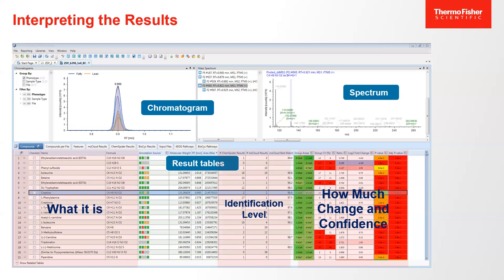Like a p-value. Now, let's be realistic. I see tons of researchers get excited: "Craig, I saw height 1 and I saw height 1.5." Generally, you're looking for a change of 10x or better to take an idea into a clinical setting. So I get excited when I see things changing 10x, because I know that my research now could produce a clinical result in 10 or 12 years that is useful to a doctor. When I'm looking at changes of 1 versus 1.5, that's a real tough change to move from the research lab to the clinical world. That's more of a lead that could produce more biochemistry studies in the future.